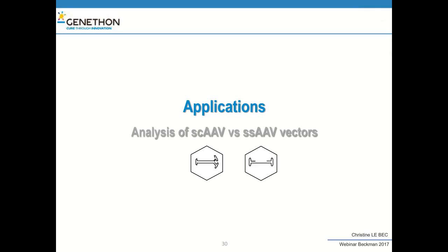Now I will show you some applications of the AUC. We have used this AUC technology to analyze self-complementary AAV vectors versus single-strand AAV vectors. Self-complementary is an AAV particle which has encapsulated a double-strand DNA instead of single-strand DNA.